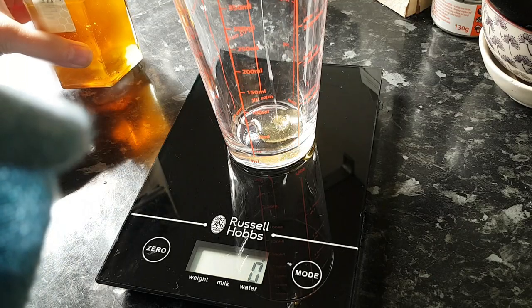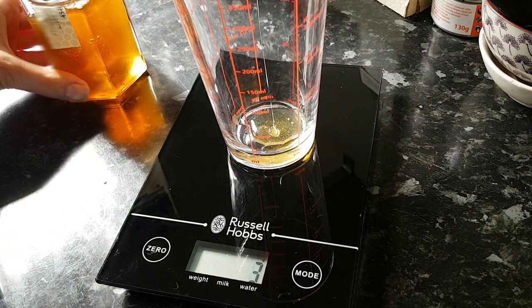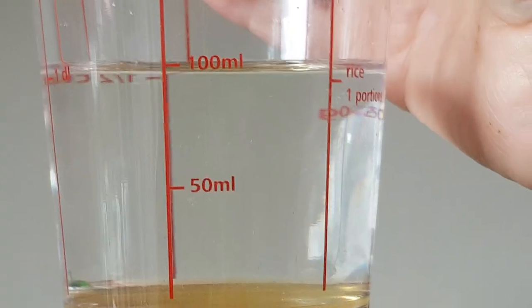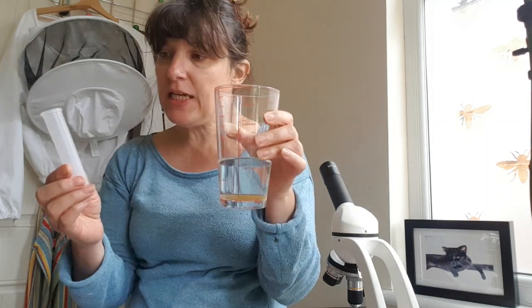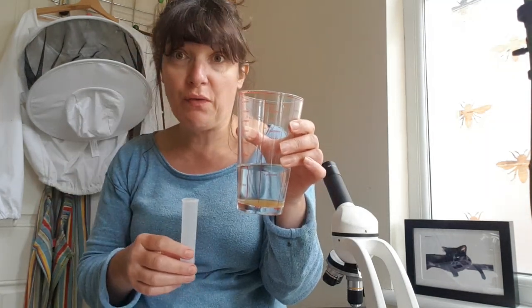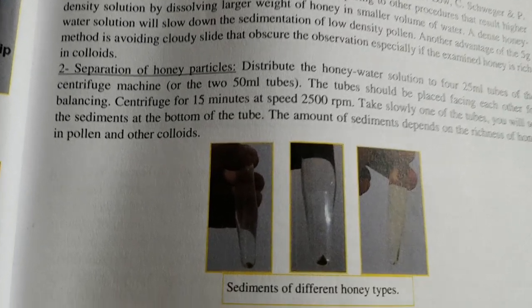I'm more familiar now with my microscope, so let's get on to testing my honey. The first thing I have to do is weigh five grams of my honey with a digital scale, stir it for five minutes to ensure homogeneity, then add 100 mils of water and stir to dissolve it. This now needs to be divided into test tubes and then rotated in a centrifuge for 15 minutes at 2500 RPM.